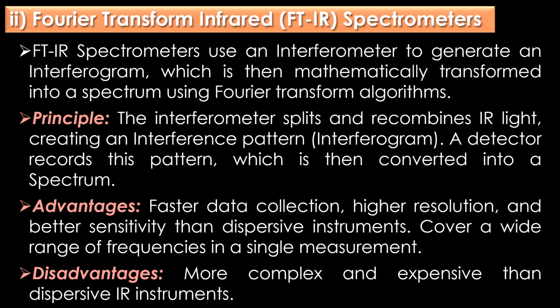Advantages: FTIR technique offers faster data collection, high resolution, and better sensitivity than dispersive instruments. FTIR spectrometers can cover a wide range of frequencies in a single measurement. Disadvantages: FTIR technique is more complex and expensive than dispersive IR instruments.